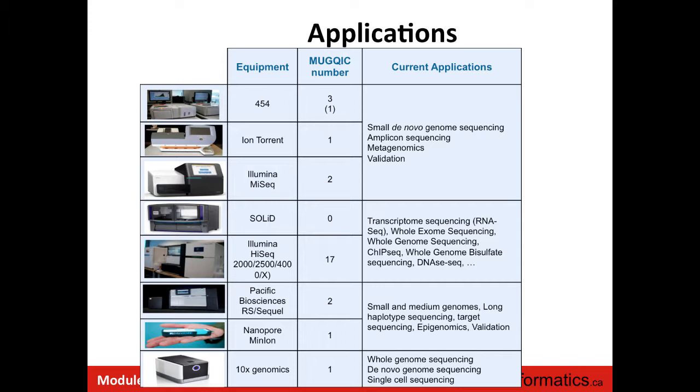But what is also really cool is that, instead of linking all molecules, you can do single cell library prep. You put in your cells, and each specific cell will be tagged with a specific barcode. Then you sequence, you have all your cells, and you can differentiate which cell the DNA comes from. So it's a really cool technology.